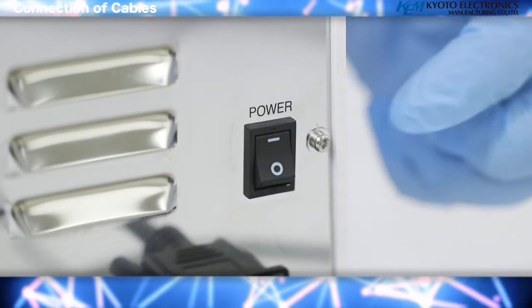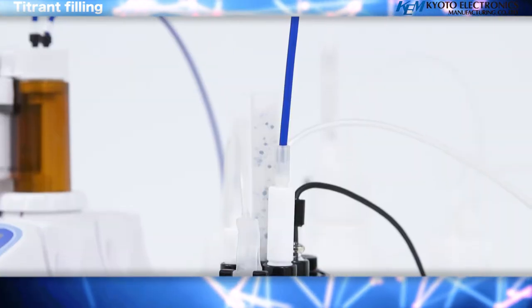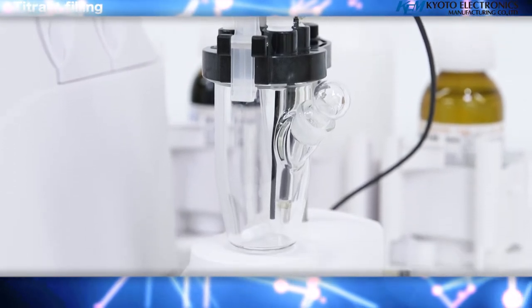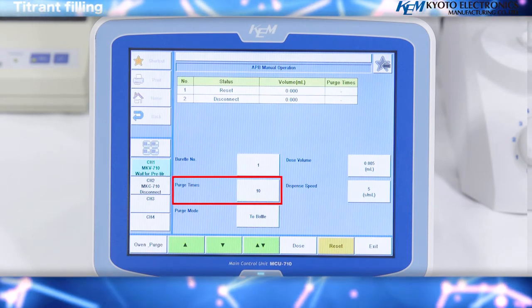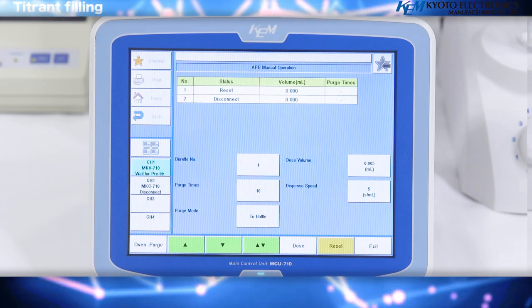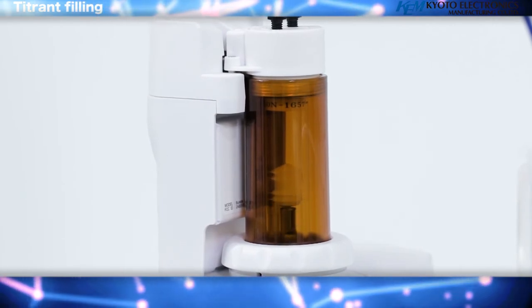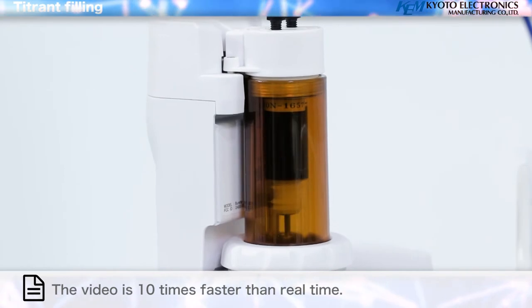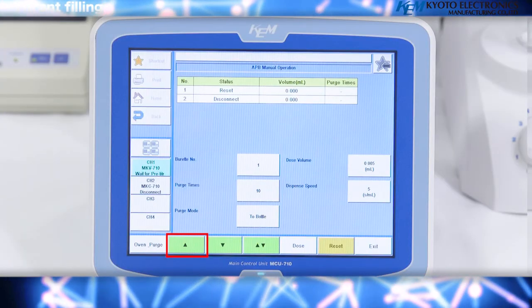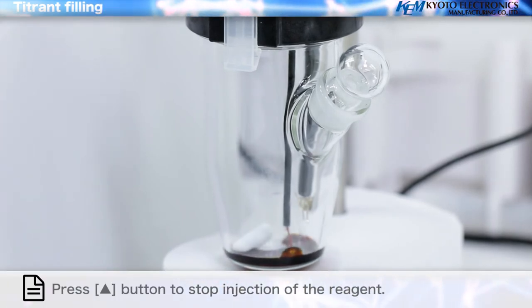Turn on the power switch. Titrant filling: A concentration difference occurs between the reagent in the burette and the reagent in the reagent bottle. To remove this concentration difference, perform a purge. Press the Option button. Confirm that the burette number is set to number 1. Set purge times to 10 and purge mode to bottle. Press Up or Down button; the piston head will move up and down, filling the burette with reagent. Next, fill the nozzle with the reagent by pressing the Up button to inject, then again to stop injection.